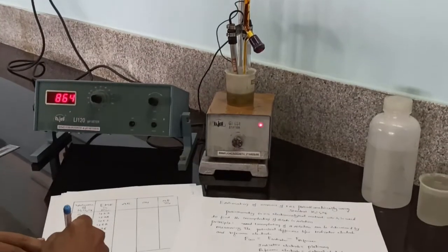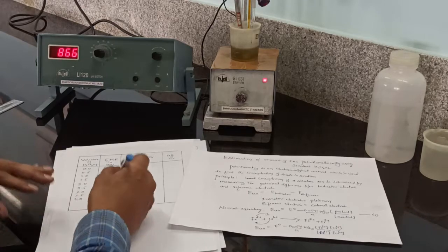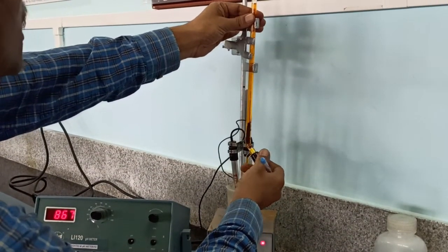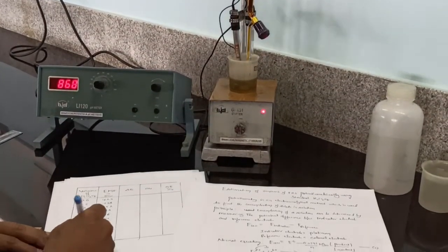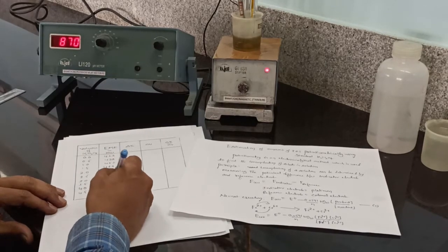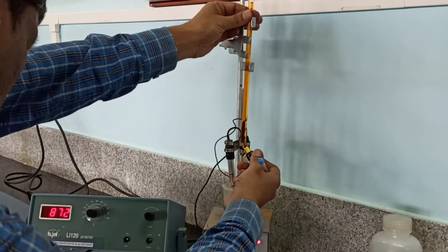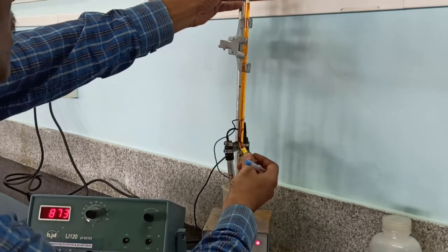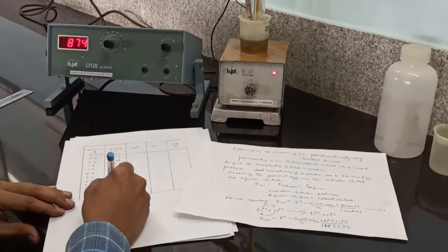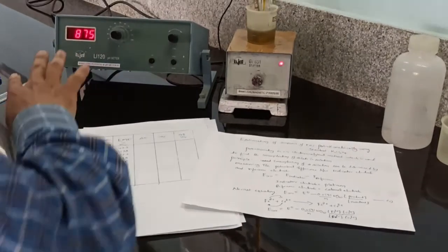At 4, the EMF is 865 or 66. At 4.5, the EMF is 870. At 5, the EMF is 874. Now stop the titration.